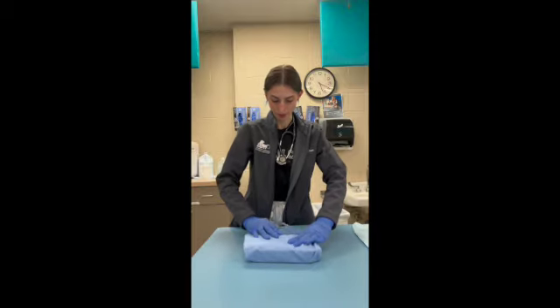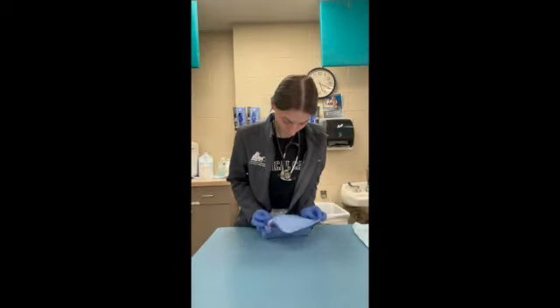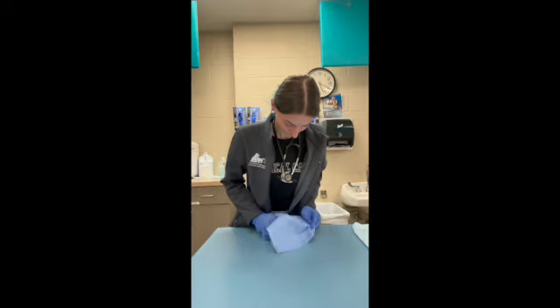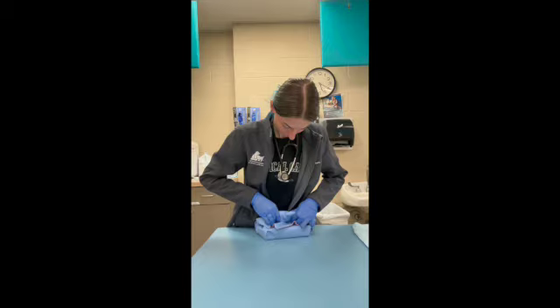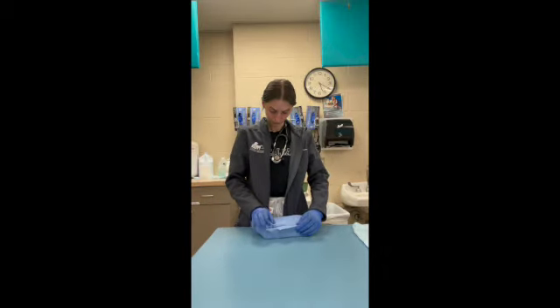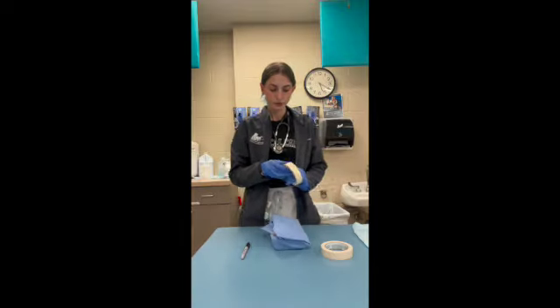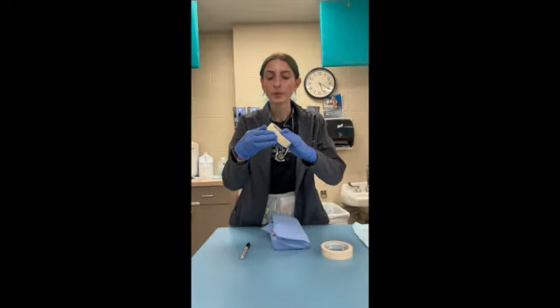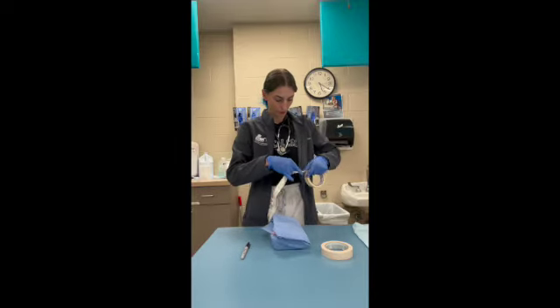I'll bring the top part over. So now we will put some of our indicator tape on the section of it.